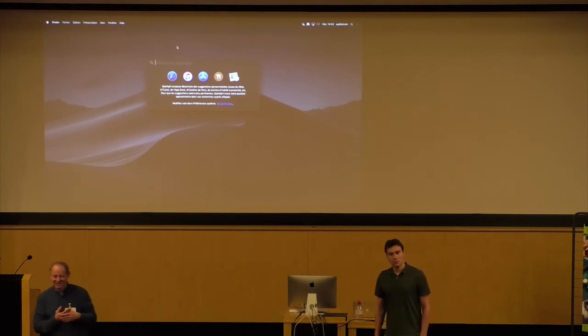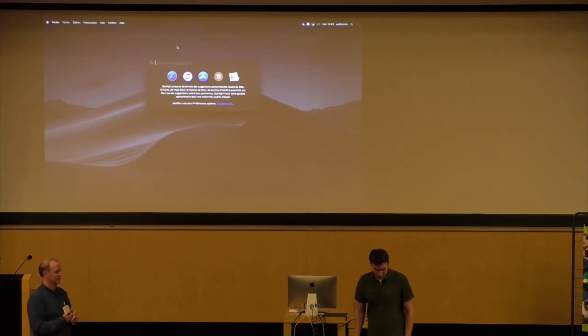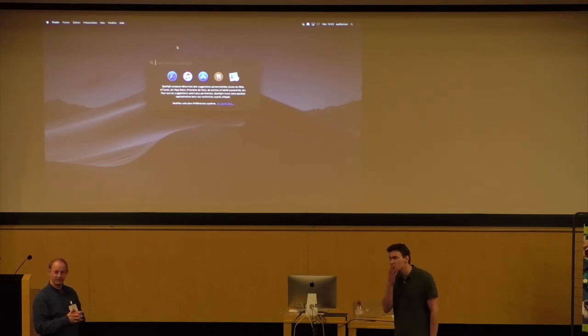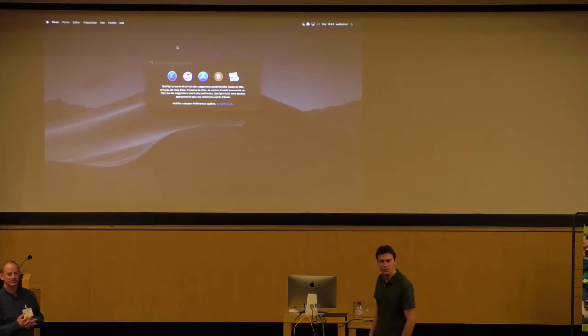You're just talking about the detector you broke. What kind of detector did you use? Can you repeat the question? What kind of detector were you using? He just mentioned a detector they have used, but it broke. I don't know. It was a laser, and then the detector was measuring some fluorescence, I guess, or some absorption. Actually, the laser broke. I was never using this one, but I think it was maybe just a UV laser, and then they were measuring the absorption, something similar to what the nanodrop is doing with UV. I have to check. I cannot tell you exactly which one.